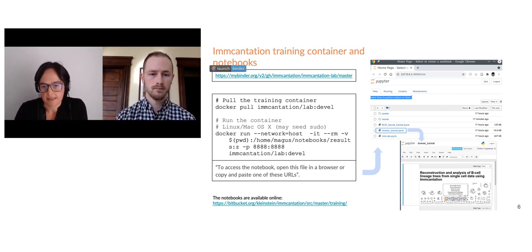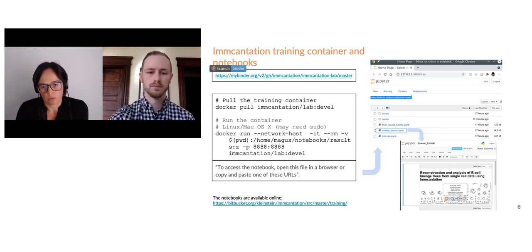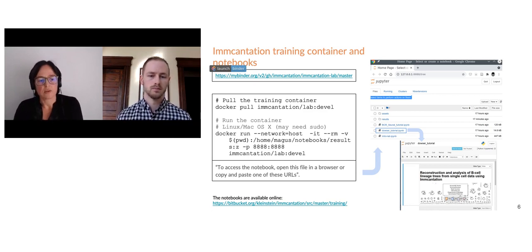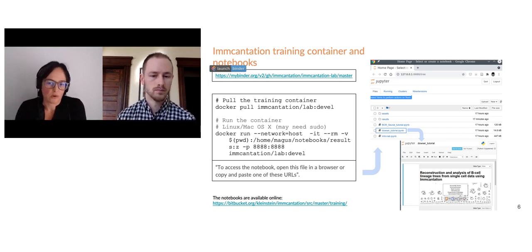And that's it. Just visit the link that I mentioned before, which you have here and in the chat. Do it now, because sometimes it takes a while to load, and you can have it loading in the background while Ken continues with the presentation. Once the website is ready, you need to open the Dowser tutorial file, and you will see the code that we are going to be using there. If you have trouble loading the site, don't let the technical issues prevent you from following the presentation, because everything is recorded and you can run the example and the code later. So just focus on Ken's presentation if you have technical issues. And now, Ken, the stage is yours.